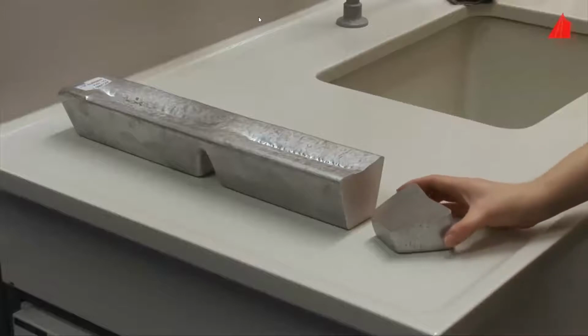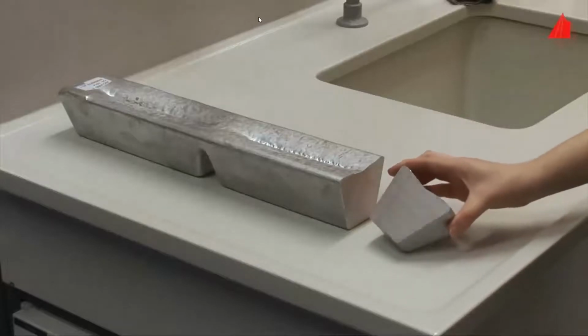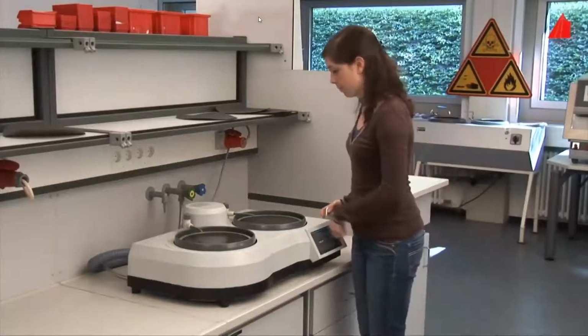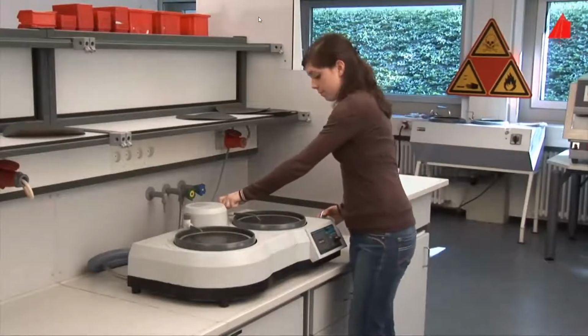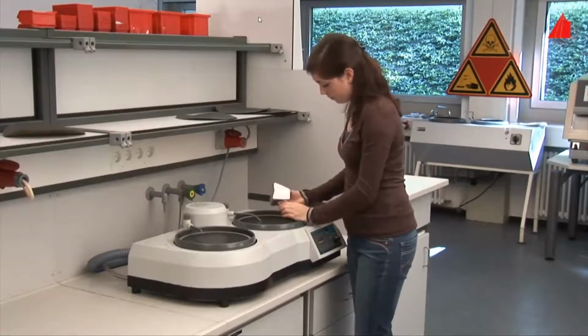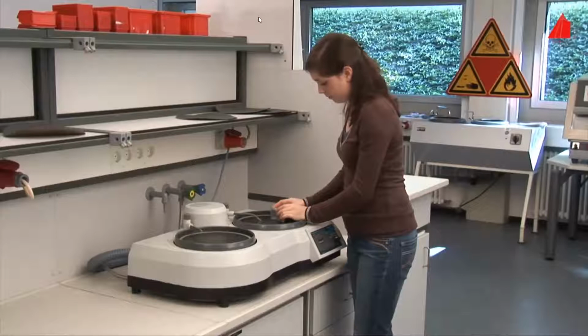Back in the lab, not much is to be seen on the cross-section apart from the typical saw marks. In the next step, the material tester removes the saw marks by careful wet grinding with silicon carbide paper. On the one hand, this serves to produce a flat surface. On the other hand, the plastic deformations are removed that were generated by sawing.